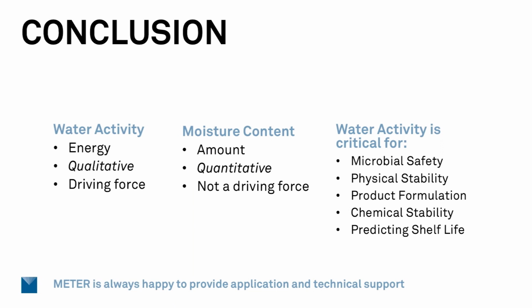Also, I've seen a lot of seasonal fluctuation in raw ingredients, namely with sugar. The moisture content can be the same, but because of the crystalline structure of the sugar, moisture can adhere on the outside. So the water activity will rise. And if that is put into a recipe, then that will increase the water activity and can also be an issue.